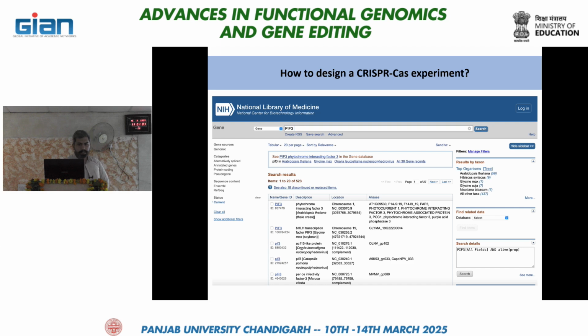Here I'll be giving you the example of phytochrome interacting factor 3, which is a gene involved in the growth and development of plant. You can take your own sequence as well.